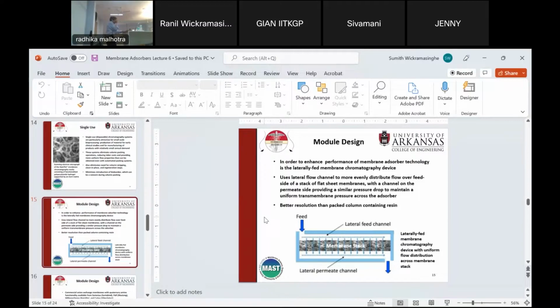We didn't get into that, but one of the reasons is the capacity limitation I told you. There's a lot of product, that's a problem. There's another reason too. It turns out, this is a very interesting point, that if you take the same ligand and attach it to a resin and then to a membrane, the idea is you bind but that you can easily elute. Sometimes it's very difficult to elute from a membrane. It's stuck there, even though it's the same ligand.